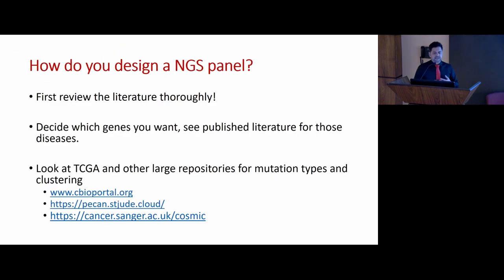So how do you design a gene panel? Don't call the company. Do your own homework. So how to do this? Review the literature thoroughly. So what do you mean by review of literature?